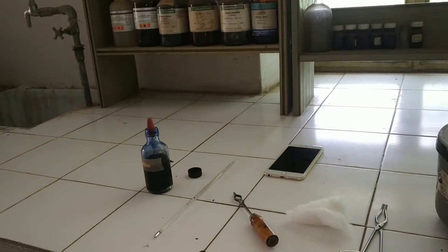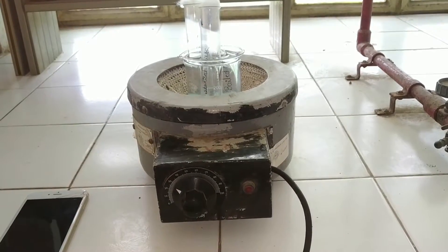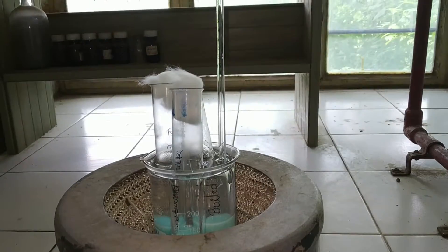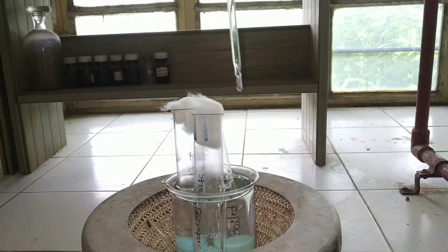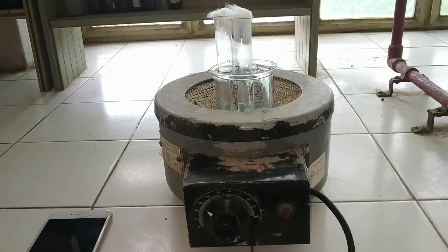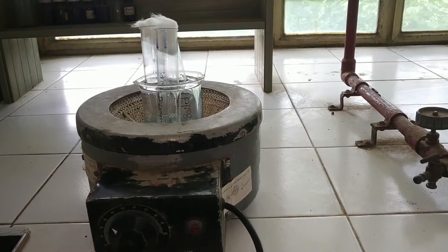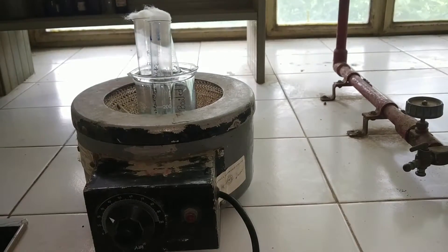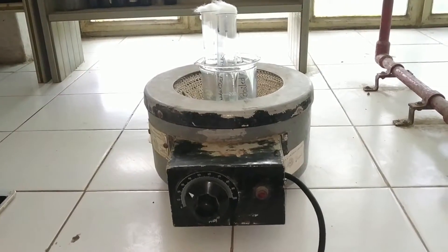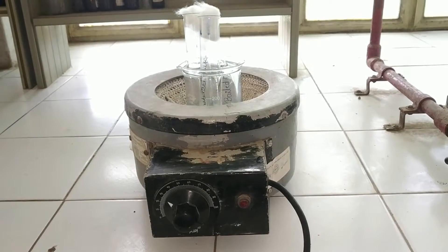Then wait for the color to change from blue to white. Check the temperature of the water, which should be at least 37 to 40 degrees. Leave the test tubes in the water bath for 5 to 10 minutes. Insert stoppers and invert the test tubes. Record the time of incubation, that is, record the amount of time elapsed for the color to turn white. Check the temperature and color change from time to time.